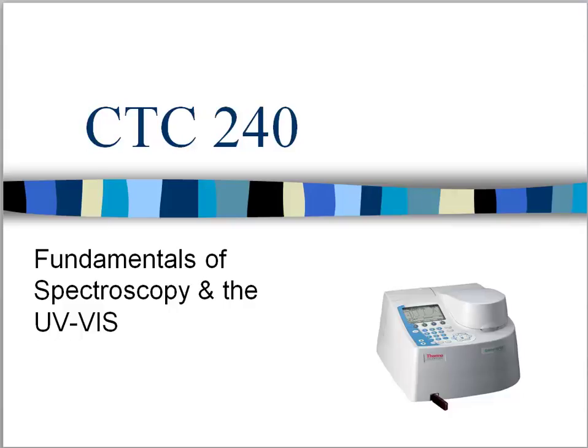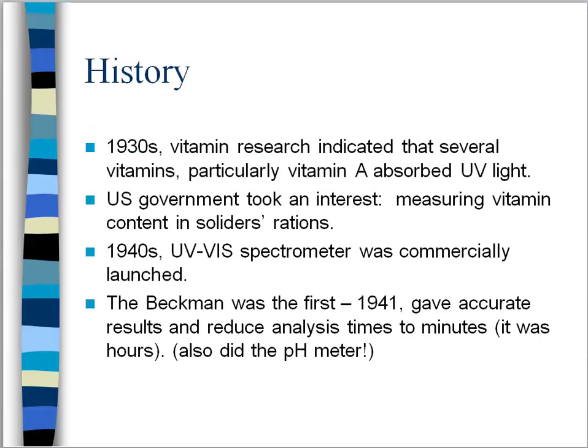So, one of the first questions that many people have is, how did all of this get started? Where did this come from? Who was the person that invented it? How long ago did it happen? So, how fairly new, maybe, is the technology? Well, the UV Vis instrument goes back and it dates into the 1930s.